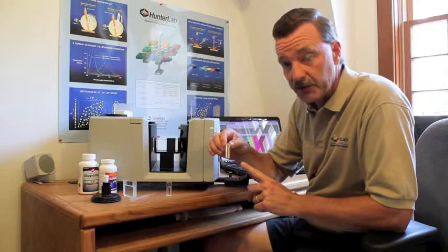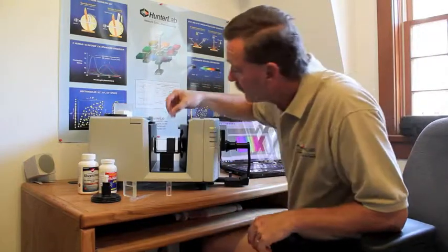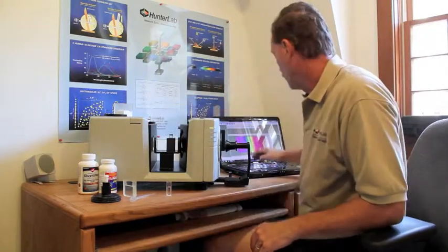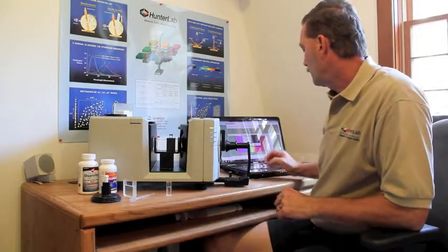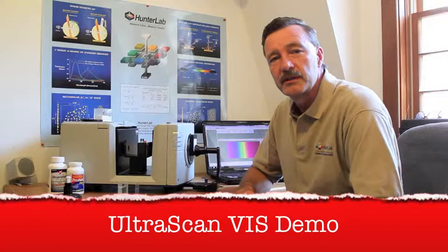Northeastern U.S. sales representative Ken Wendt will now demonstrate how to use the Ultrascan Viz, a visible range, high-performance benchtop system. During the past five years, Hunter Lab has done extensive work in biopharm applications. In today's demonstration, I'm going to measure the transmitted color of liquids, the reflected color of powders, and the reflected color of some finished products.